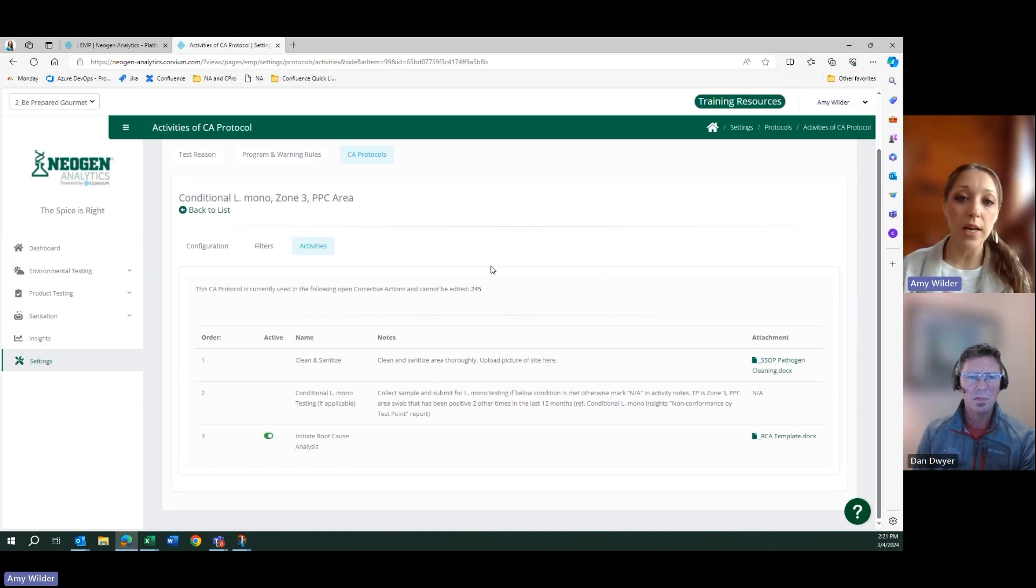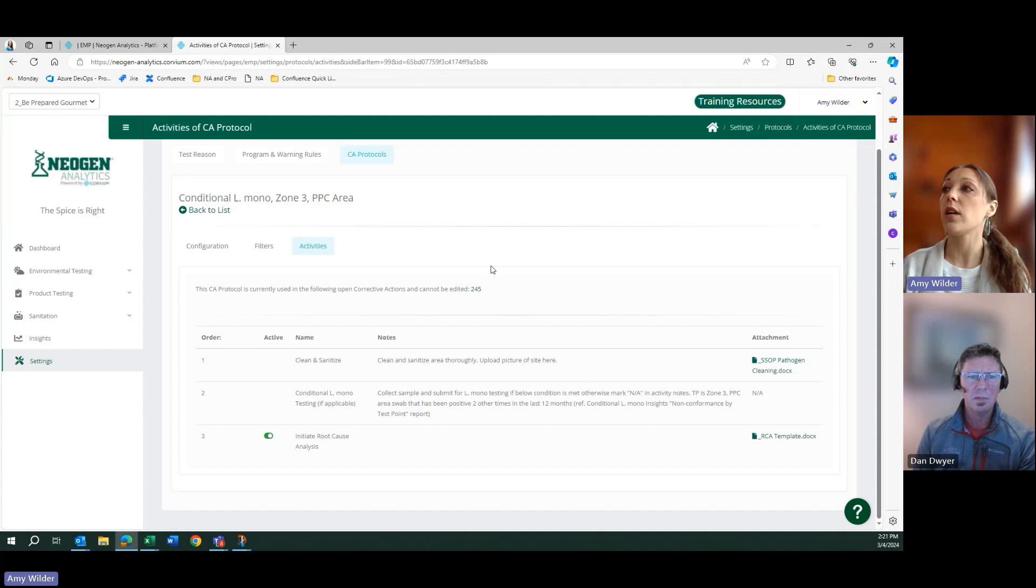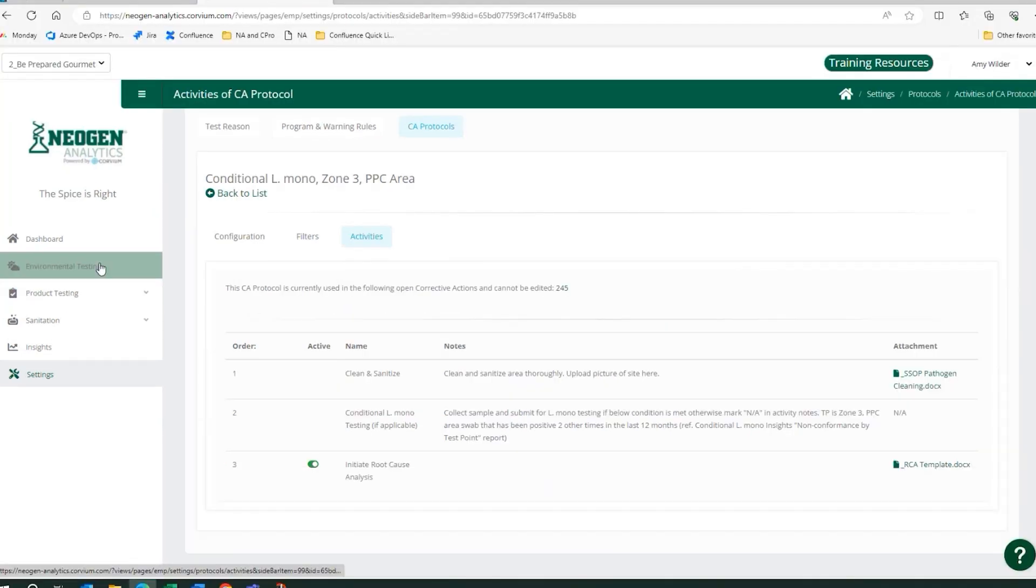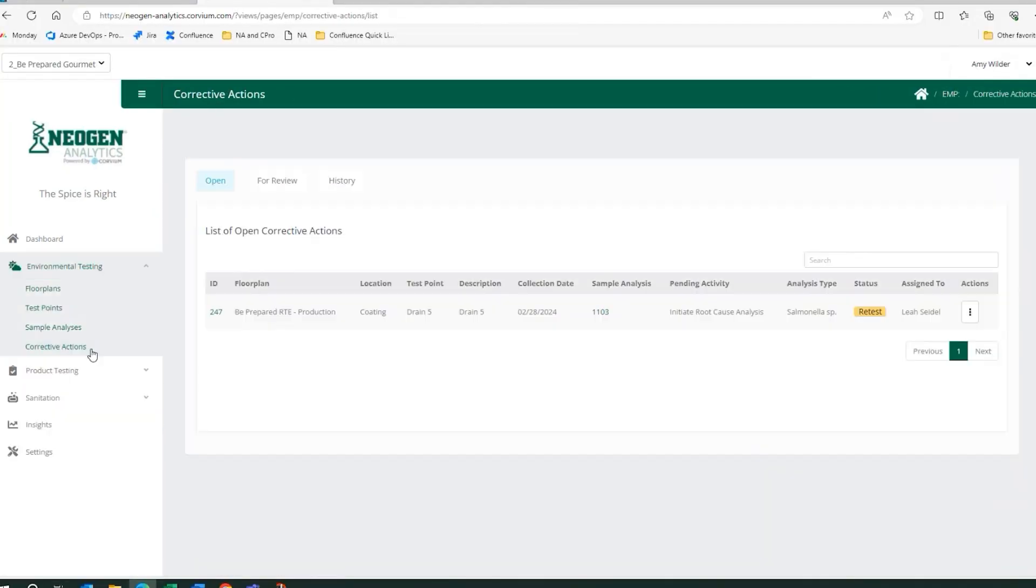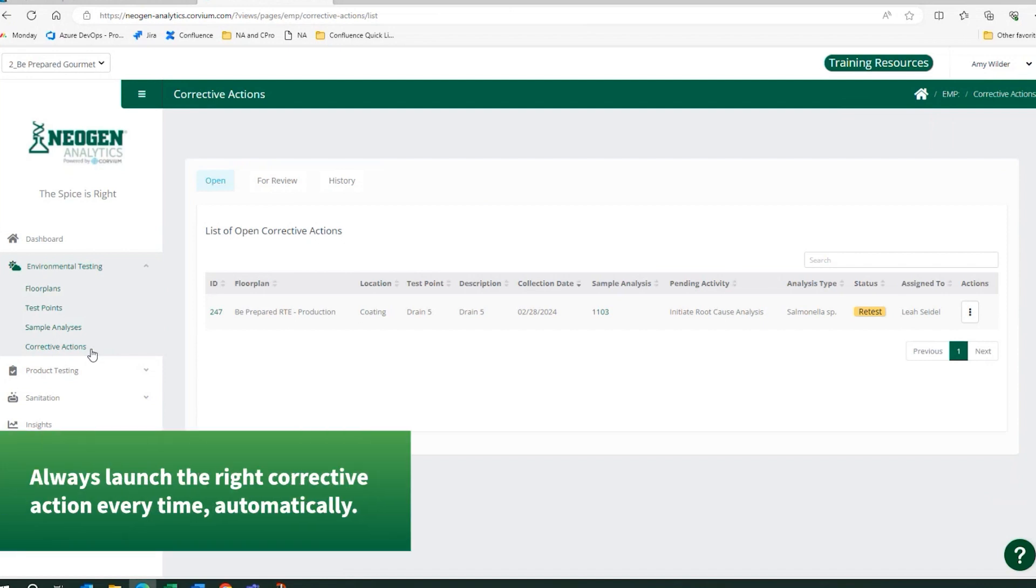There might be some cleaning, there might be some investigation. Upon receiving a result, a non-conformance or an out-of-spec, either through manual entry, through automation, with integration as an example, the software would automatically trigger a corrective action.